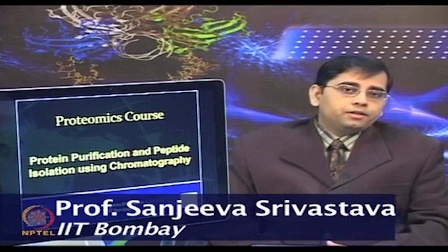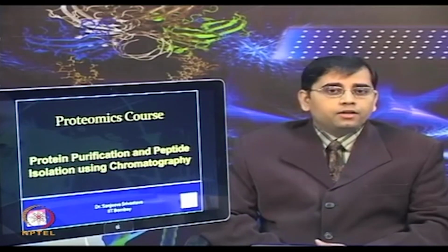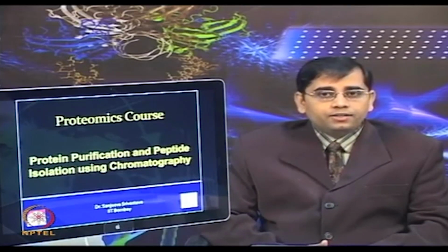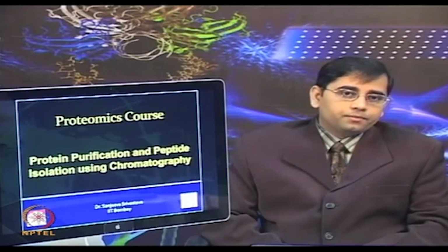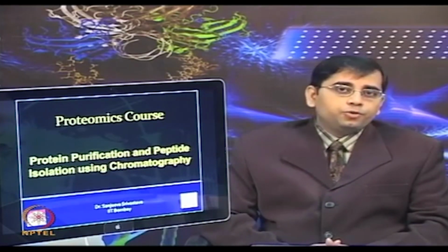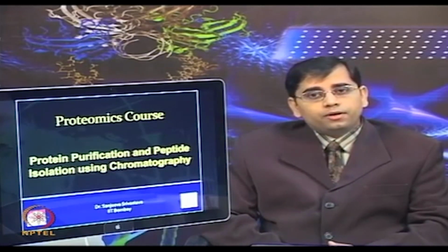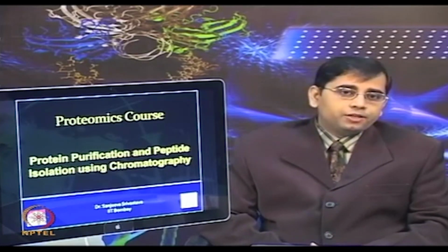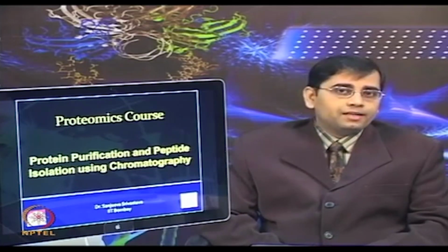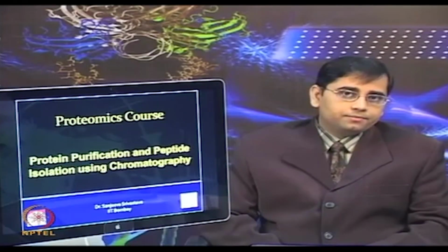Protein purification by conventional chromatography is usually achieved by combining chromatographic methods such as gel filtration, ion exchange and affinity chromatography. From a complex proteome, it is challenging to purify a protein in a single chromatographic step. Therefore, sequential pre-fractionation steps involving different modes and types of chromatography methods are becoming necessary for proteome level analysis.